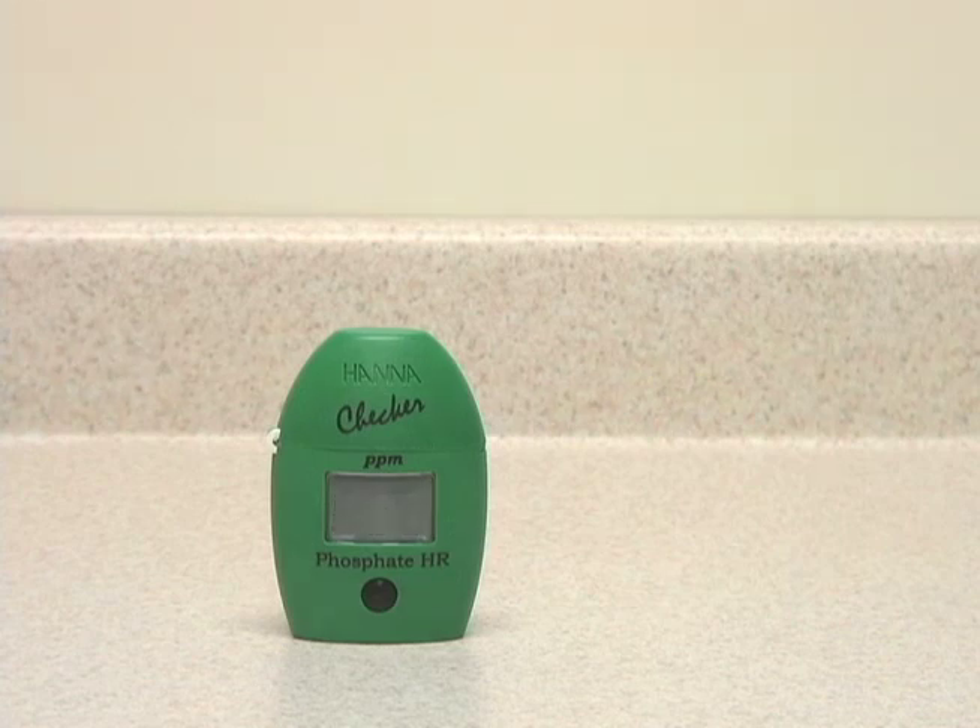So the five-minute reaction time has elapsed, and now the checker is taking a measurement. 6.0 parts per million phosphate.